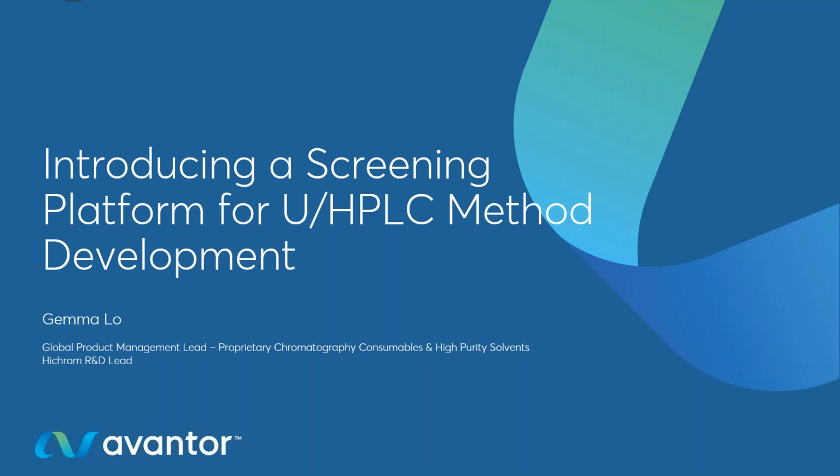The webinar today is introducing a screening platform for HPLC method development, and this is the final part of our three-part series titled A Systematic UHPLC and HPLC Method Development Strategy with Complementary Stationary Phases to Maximize Selectivity and Resolution.